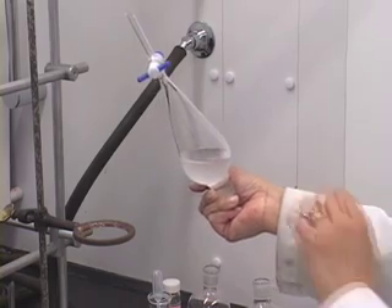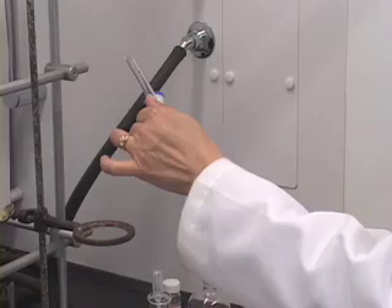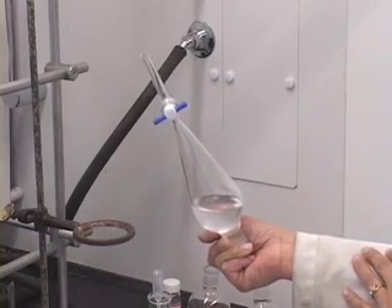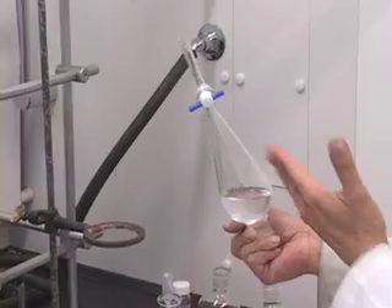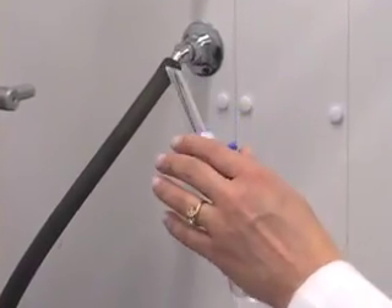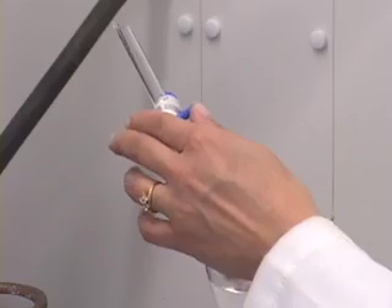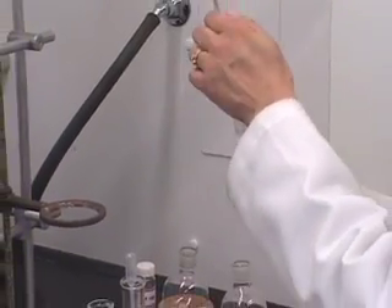That was a little bit more vigorous shaking. Open it, close it. By shaking, what we are doing is making sure that the components that should go into the aqueous layer are indeed going into that layer. In other words, the acid is reacting with sodium hydroxide — we want to ensure that all of the acid is reacting with sodium hydroxide. Last shaking.